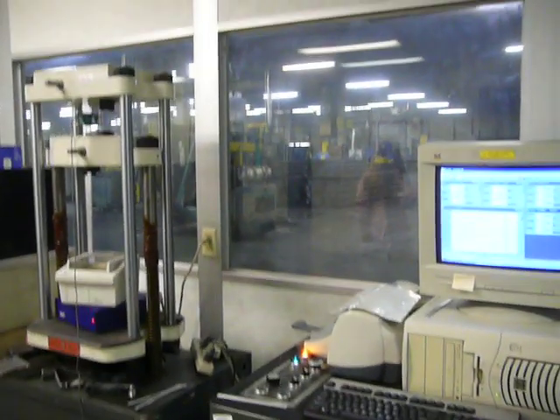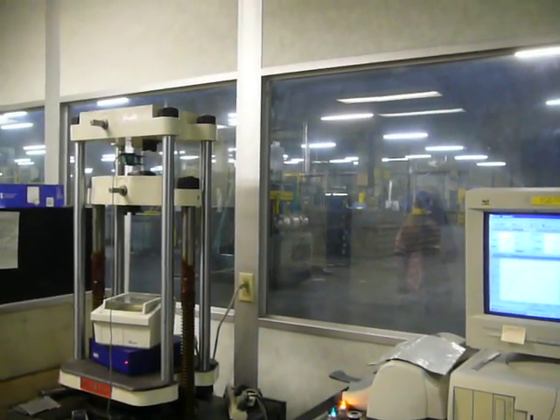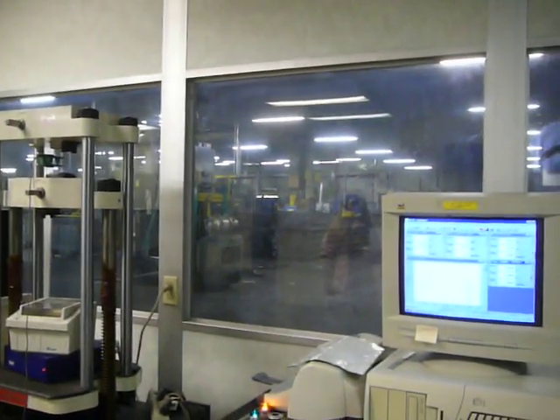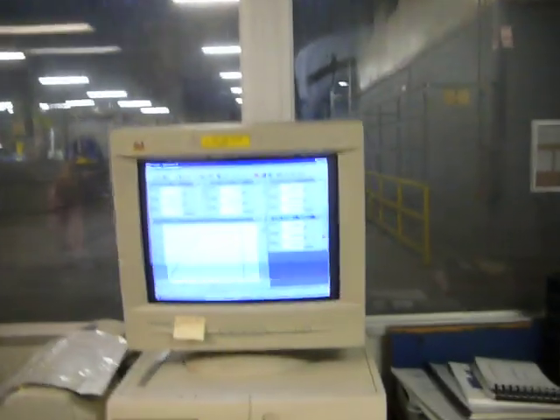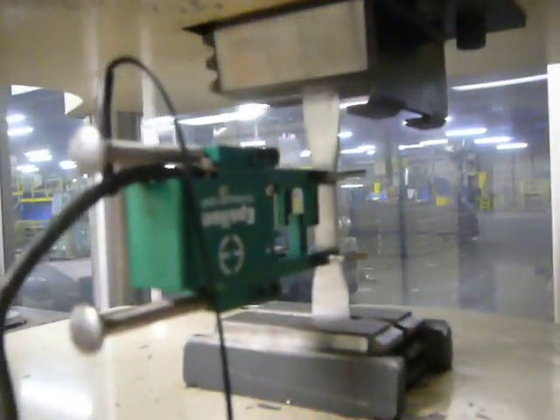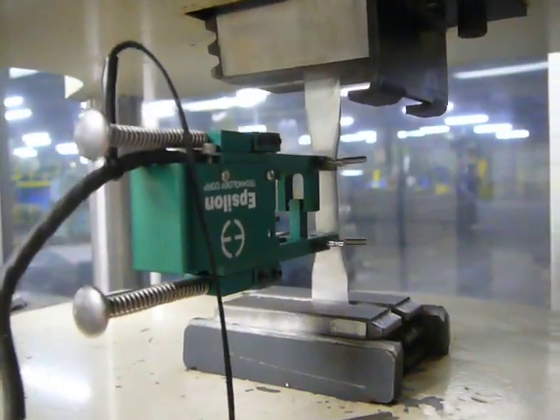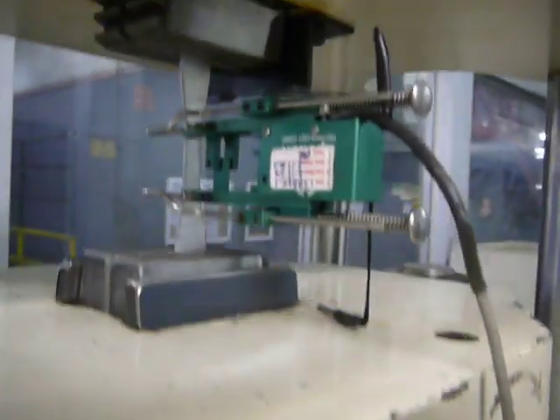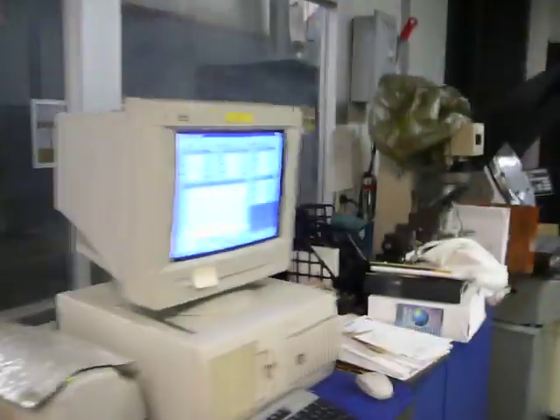We're testing a Tinius Olsen Super L 60,000. It's got the M-Test-W software. We have a piece of aluminum in here. We're going to test it. It's got the Epsilon clip on it. We're ready to go.